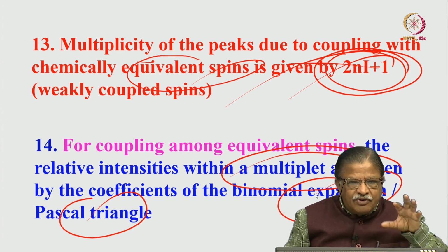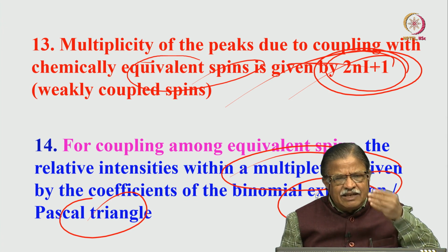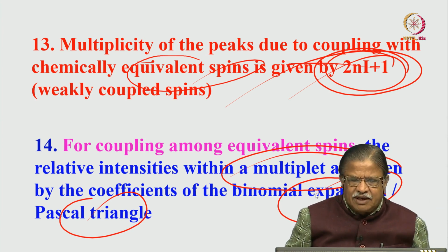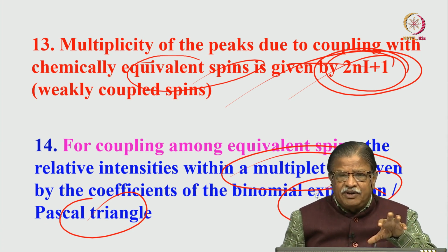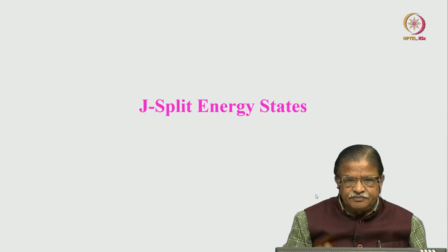Before we go further, we should know what the factors are. The scalar coupling is a very small interaction, especially when we are dealing with protons. But so much information is available. These are all the salient points which you should remember when you want to understand scalar coupling.